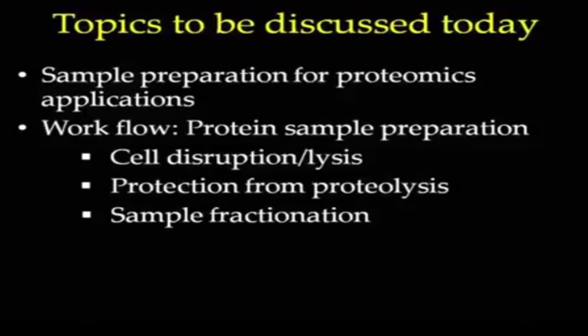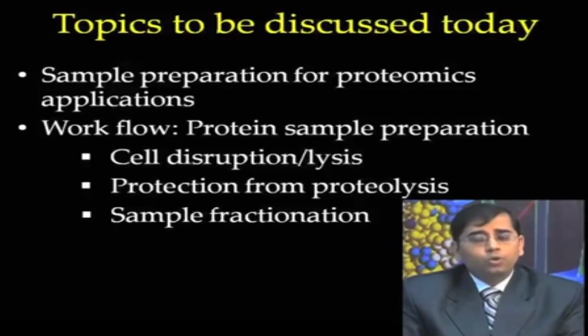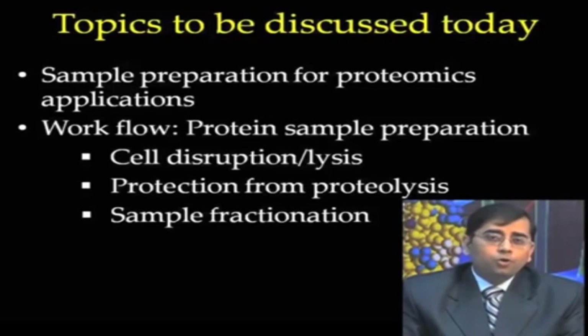I will give you a workflow for protein sample preparation: the first step, how to disrupt the cell, how to lyse them, how to protect the cells during the lysis step so that there is no proteolysis occurring, how to fractionate the samples.